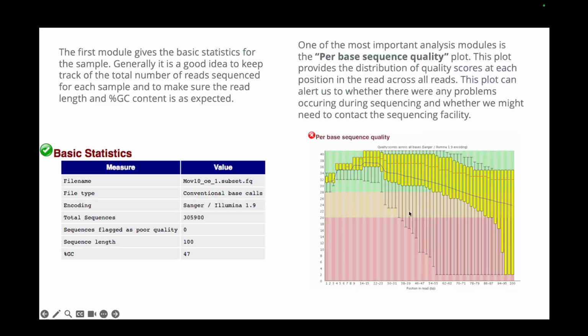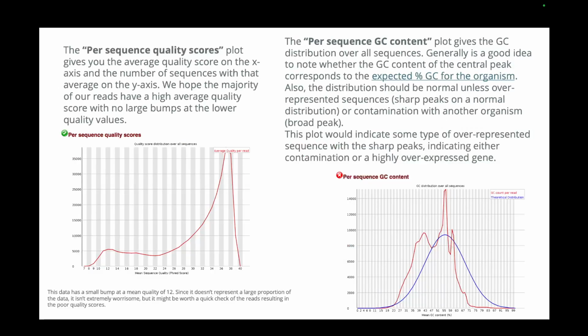Also, along with that, you will have per base sequence quality. So you can see, in each of the bases present, what your sequence quality is. This is actually not a good plot for this, because you see in some cases you have very high sequence quality, in some cases you have very low. So this is actually not very good data to go on with. These kinds of information you can get using FastQC.